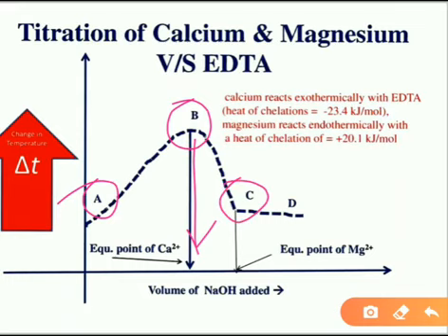If we extrapolate like this, we get the endpoint for calcium, and if we extrapolate like this, we get the endpoint for magnesium. Like this we can calculate.